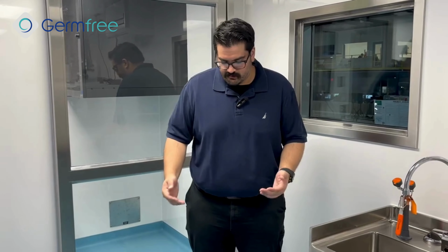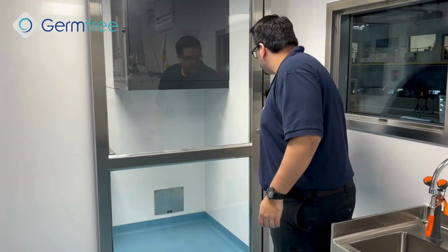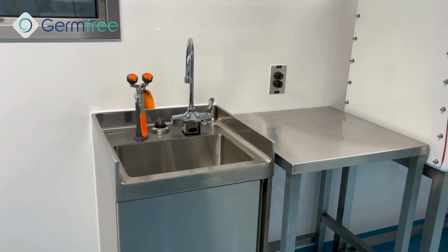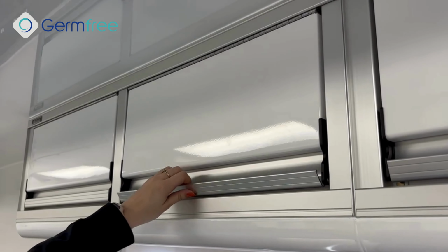Okay, we're now standing in the main CL-2 laboratory. So this trailer is going to Canada, and the floors are actually outfitted with a heated electric floor system. This trailer also has a slider door, which is the first I've seen in a mobile platform. To my left, we have a hands-free sink required for CL-2, also equipped with the deck mount eye wash. To my right, we have outfitted the slide out with overhead storage cabinets.